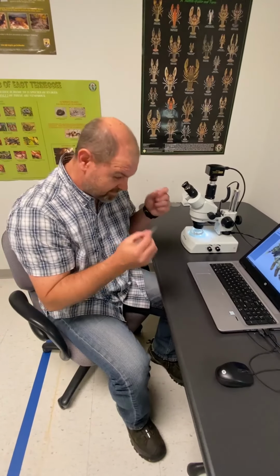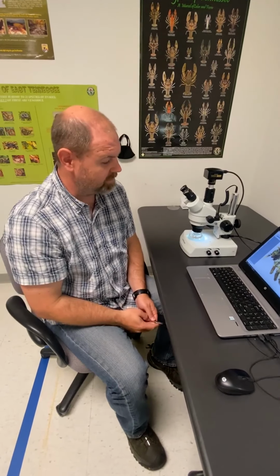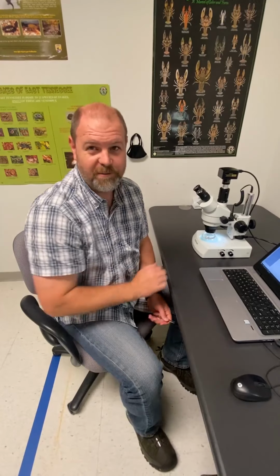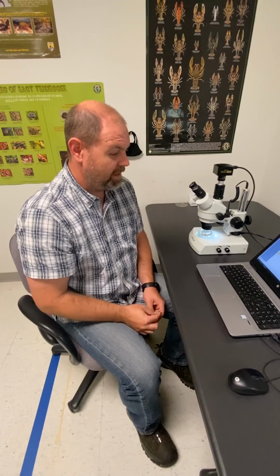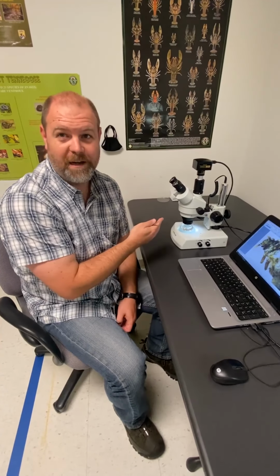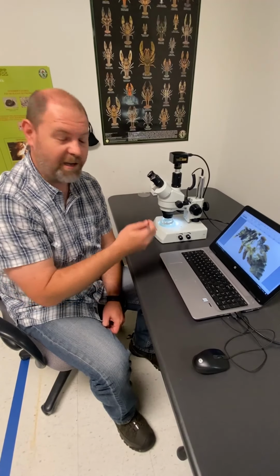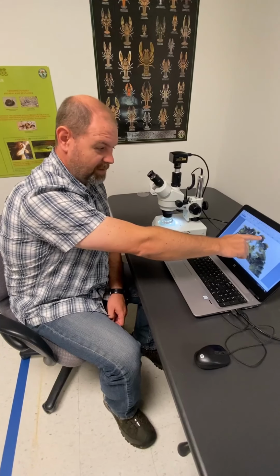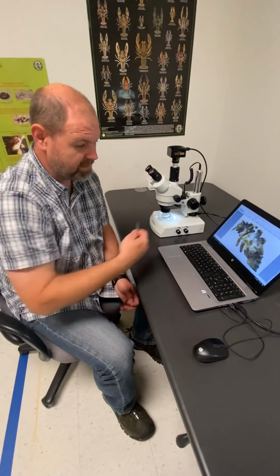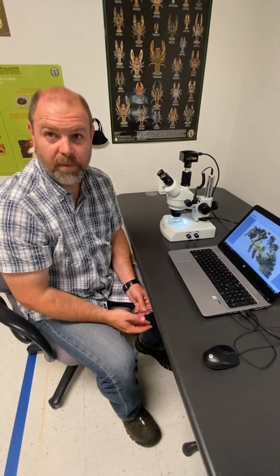It's faster. I can use both hands and eyes, and there is a little bit of lag time using the camera. It's a little unintuitive. Once you get used to working under the microscope, it becomes a little unintuitive to try to use the camera. But if I'm seeing something, because two people can't look through the microscope at once, if I'm trying to show Beverly something, I can pull it up on this, and I can look at this spine right here. Are you seeing the same thing I'm seeing? What do you think this is? So it makes collaboration a lot easier if you're doing that, or teaching somebody.